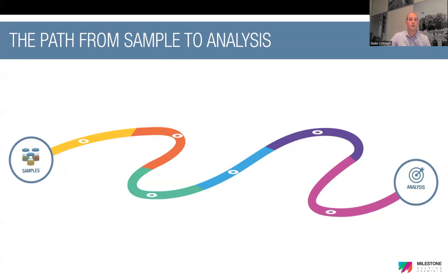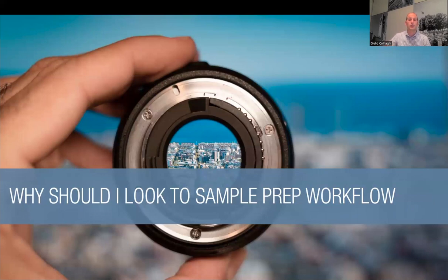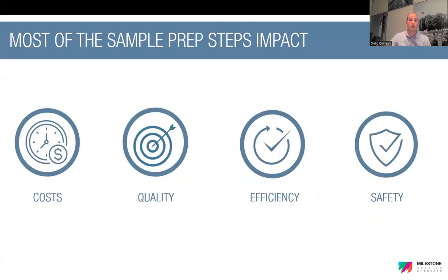Each of these steps, when you consider the total workflow, has a direct impact on cost, on quality, on efficiency, as well as on the safety of the lab. So looking at the entire sample preparation workflow is important because it can boost the quality and efficiency of the lab, it can increase safety, but at the same time, it can lower the cost of analysis.